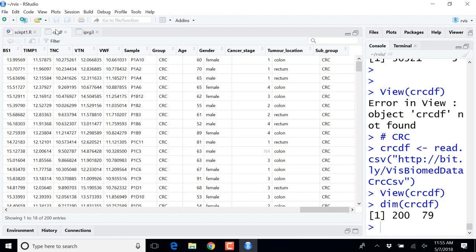Would the number of peptides for that protein be associated, or does it have to be a constant? No, no. That is a very good example. So this protein has been observed with 25 peptides. This, 2 peptides. 77 peptides, 1 peptide. And that is the kind of metadata I would be interested in, because maybe I don't want to rely on proteins that have been identified by a single peptide as much as a protein that has been identified with tens of peptides. Another idea? Going off of that, various confidence scores or posterior error probabilities, things like that.